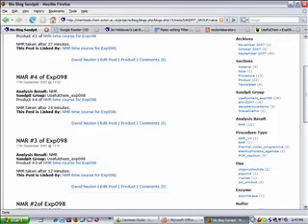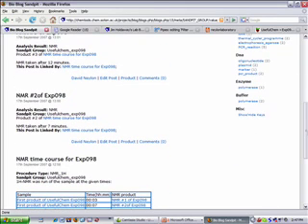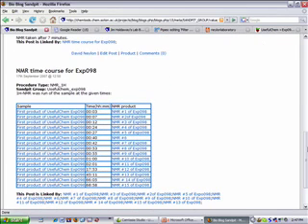Now, you'll see a lot of these are NMRs, so the experiment was based on an NMR time course, taking a series of analyses over time. And I wanted to separate those out because each piece of data, so you can upload the NMR data for each of those things, and I actually have put those in there, in fact. But to associate a particular product with a particular piece of data, so a computer could tell which one was which, it's necessary, I felt, to create a separate post for each of those NMR samples.